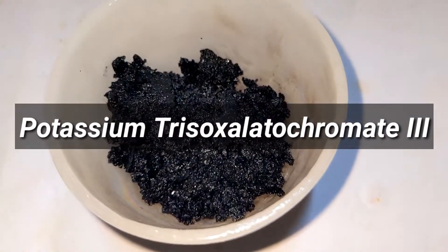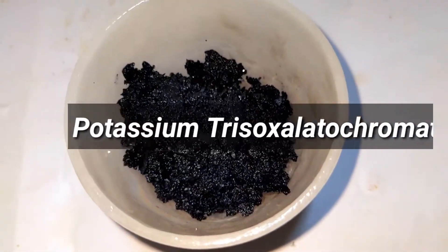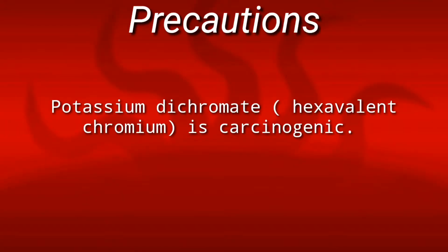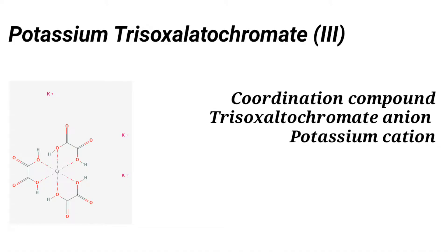In this video we will be preparing the coordination compound potassium trisoxalatochromate(III). This coordination compound contains the trisoxalatochromate anion, a very large complex anion with chromium in the +3 oxidation state surrounded by three bidentate oxalate ligands, counterbalanced by three potassium cations.